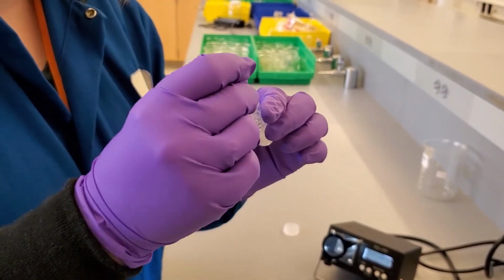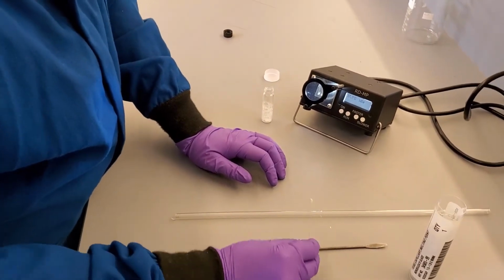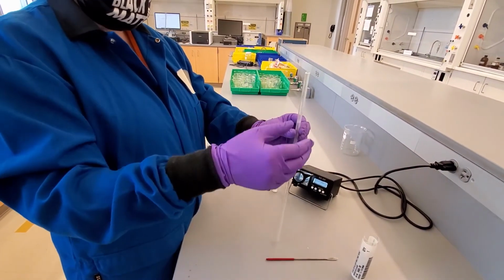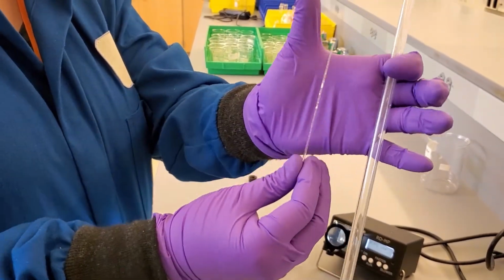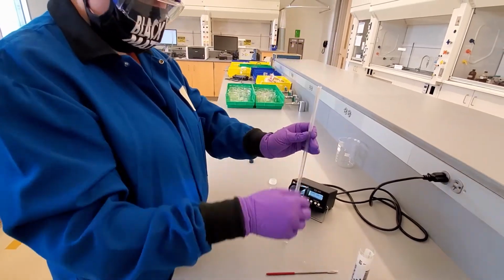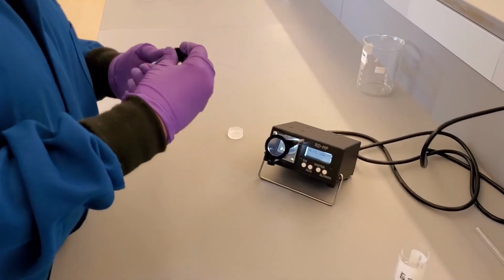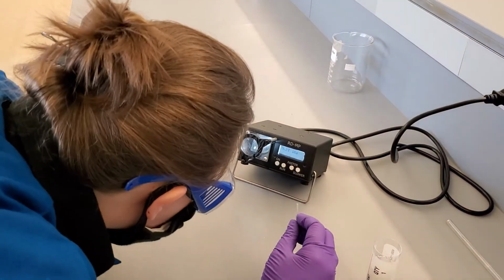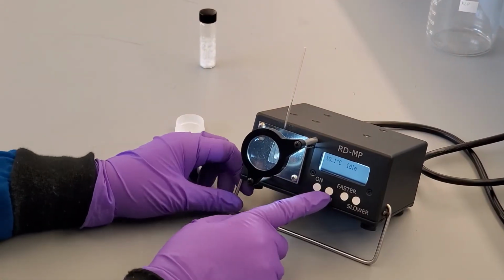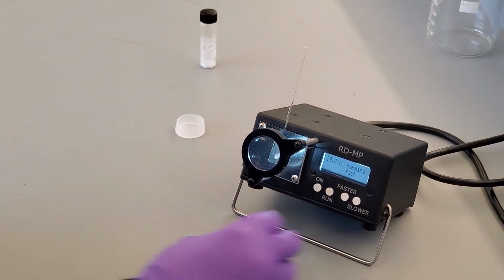Carefully tap the closed end on the lab bench so that the product falls to the bottom. You can also drop the capillary tube down a glass tube to get the product to fall to the bottom. Once the product is at the bottom, place it in the melt temp and start the temperature ramping on the fastest setting. It will take a few minutes for the temperature to reach the melting point of borneol or isoborneol.